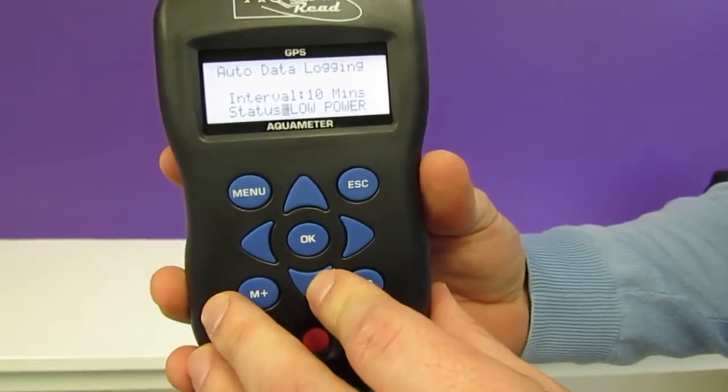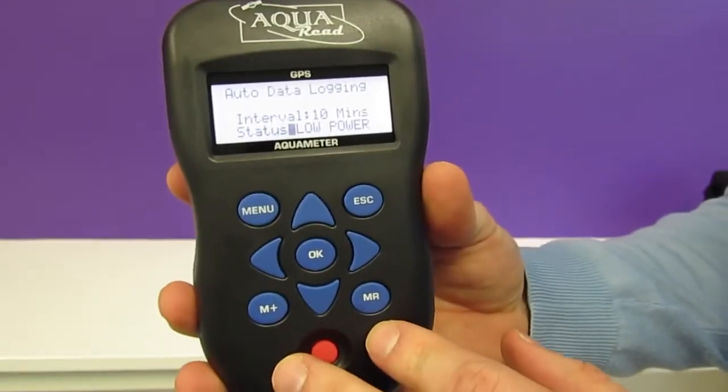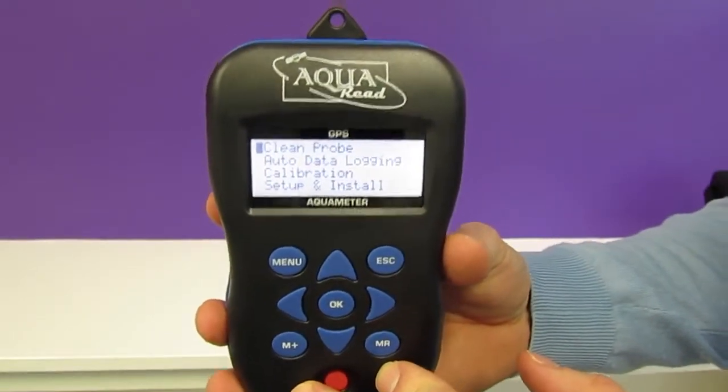In this low power mode the entire system will go to sleep in between readings maximizing the battery life. In this setup you can log for up to 38 days continuously.